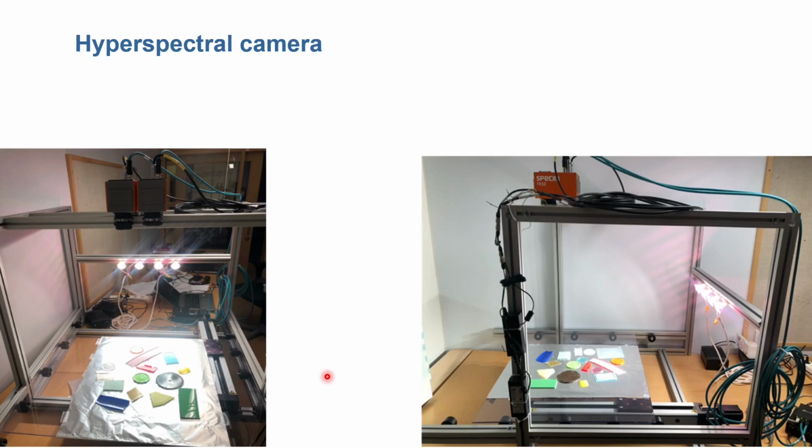You see here a couple of images from our vision lab at the university. Here is a frame, and on this frame are assembled 2 hyperspectral cameras, as well as illumination. These are halogen lamps that also emit a lot of light in the infrared region. And on this moving table that is controlled by a linear stage, there are several of these plastic items that can be imaged by the 2 cameras. From that data, it is possible to identify these image components and classify them according to what kind of polymer type this plastic is made out of. So it's a material classification in this case.